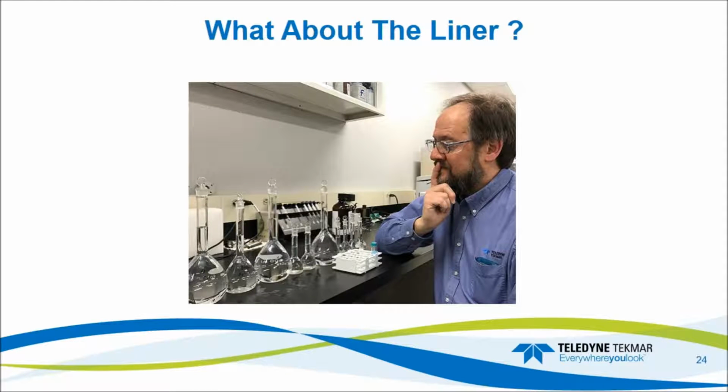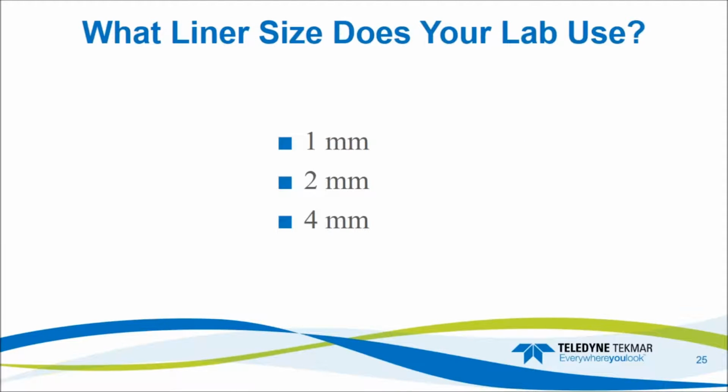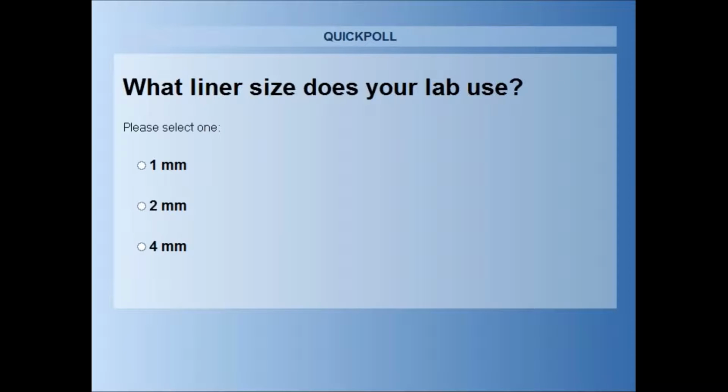So, what about the liner? What liner size does your lab use? I'll let you vote for these 3. Let us know what size liner you may be using. We typically recommend the 1 millimeter for purge and trap.